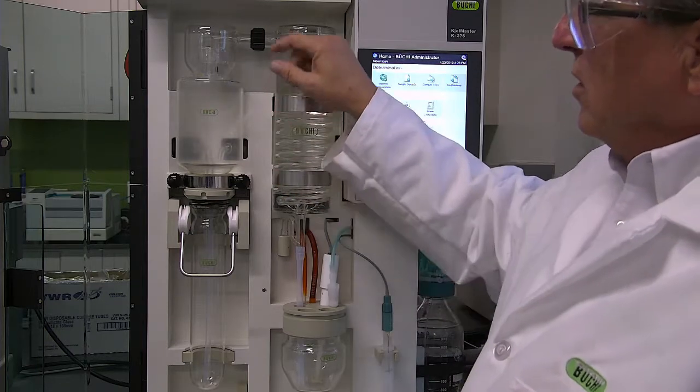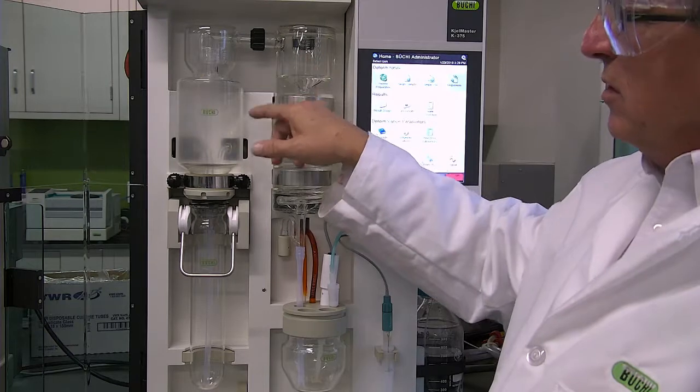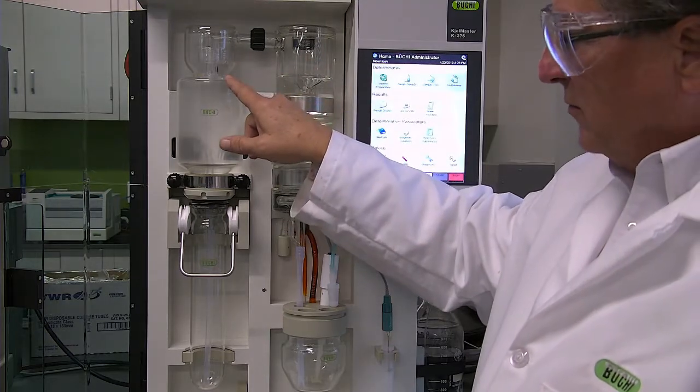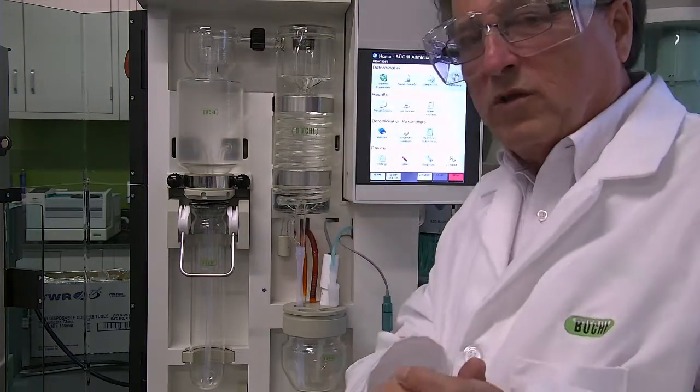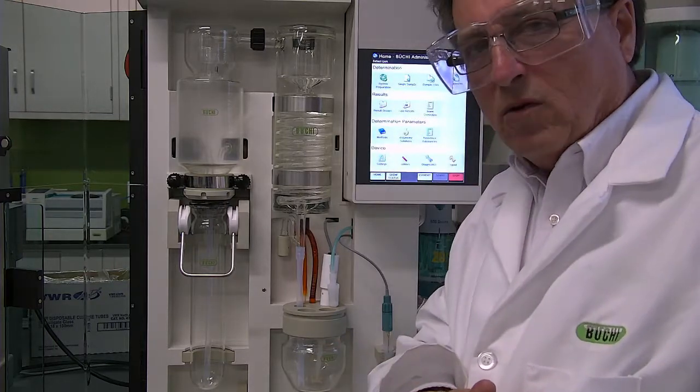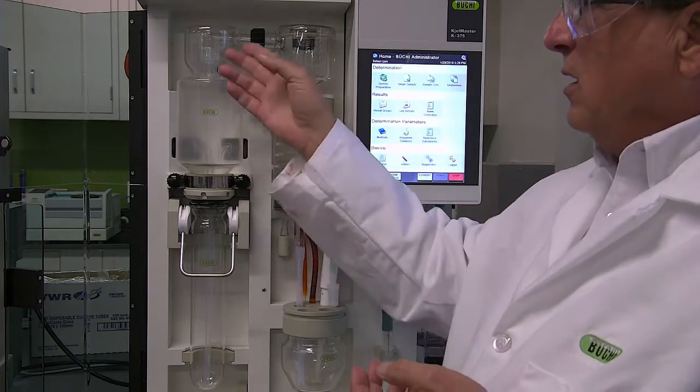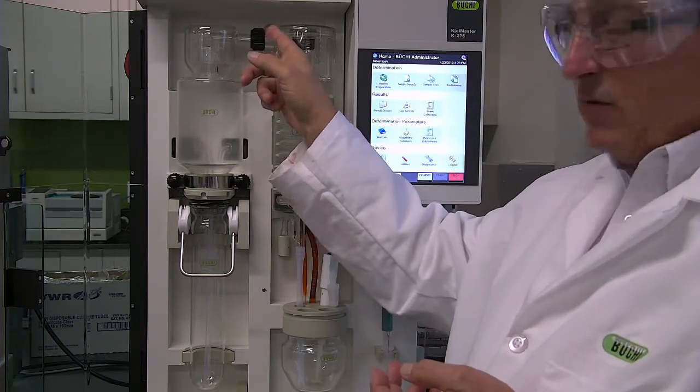The first is up here. This is the seal between the condenser and the splash guard. This is probably the most likely reason why your nitrogen levels could be low. When the ammonia is evolved, it goes up here and leaks right out.